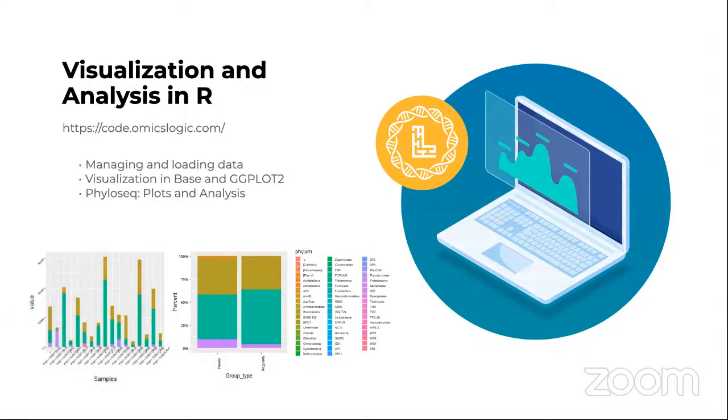And I will explain in a couple of minutes how this works and how we will use this for generating figures that you see here on the screen. Okay, and for Nita's question, we will learn about the Simpson index and the Shannon index. They have different ways of calculating differences between the sample composition, but those specific differences could be interpreted in different ways depending on the type of input data we have and depending on the question that we have.